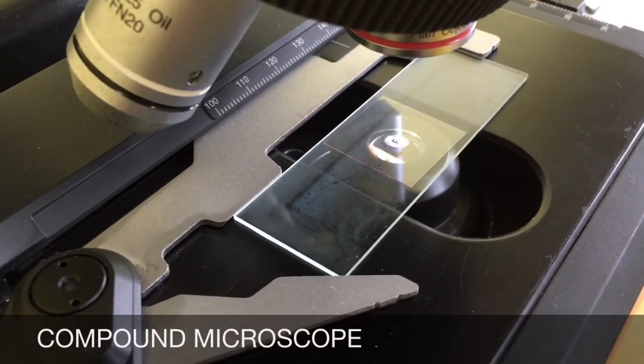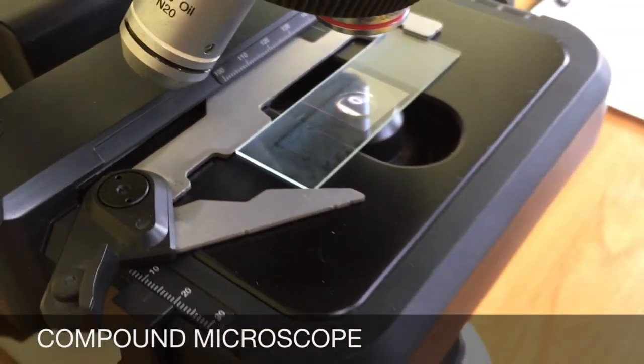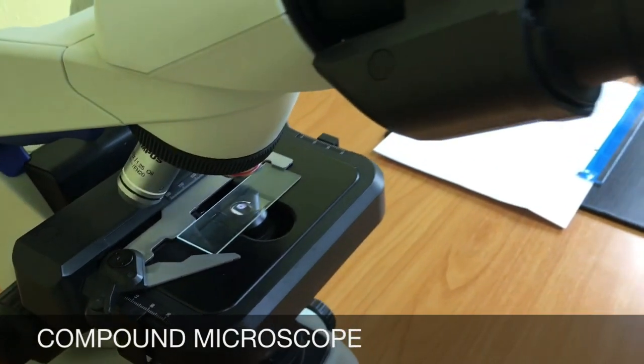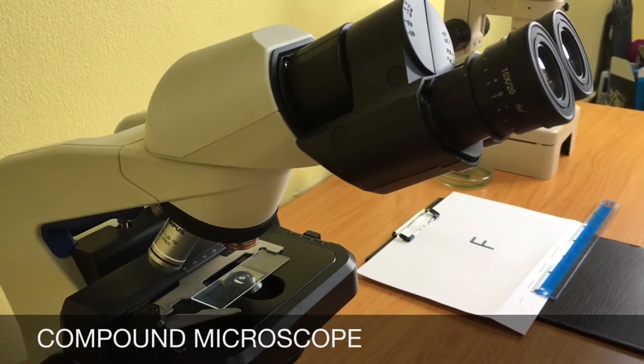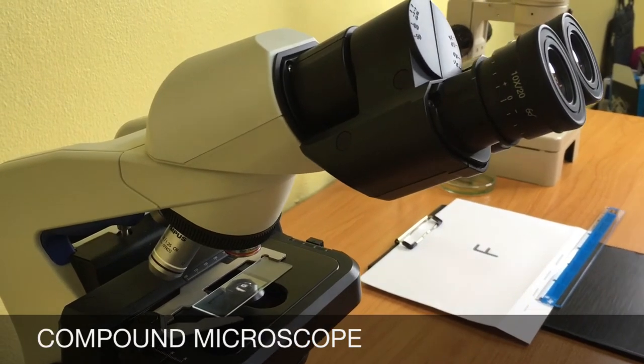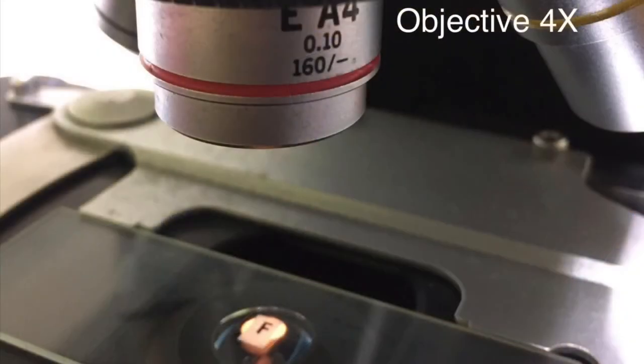Then, observe the letter F under the compound microscope. Please note that we use tenfold magnification of the ocular lens and the fourfold magnification for the objective lens.